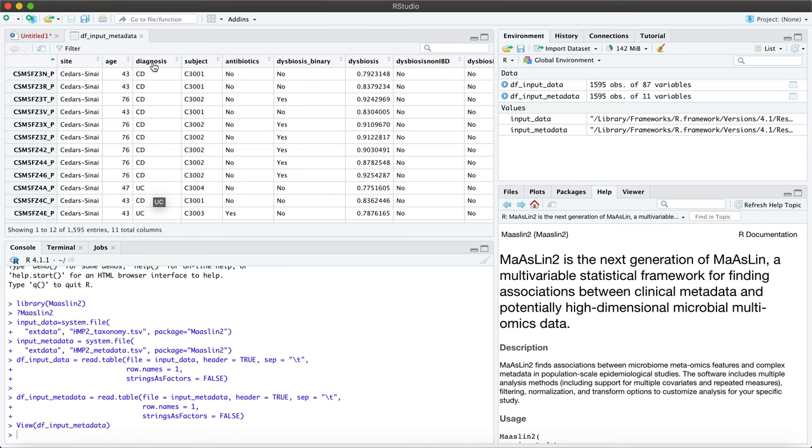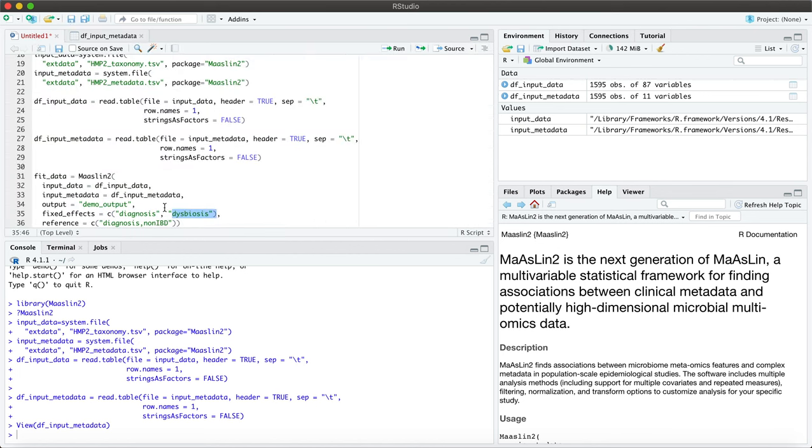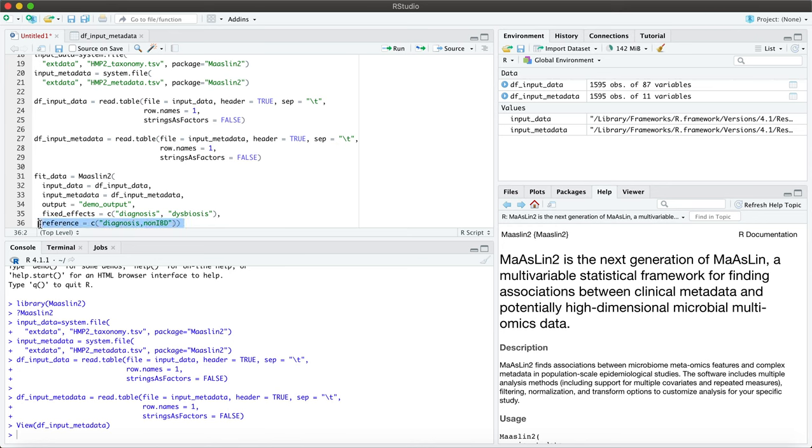Now for the categorical variable you do have to specify what your reference will be. And when you do that, make sure that there are no spaces in between the variable and the level or it might result in the wrong reference level being used. So you saw that we had CD, UC, and there was also a third level non-IBD which we've included as a reference here.